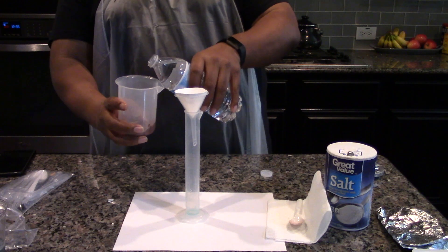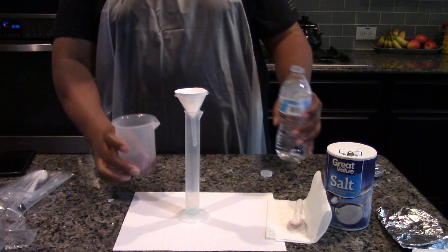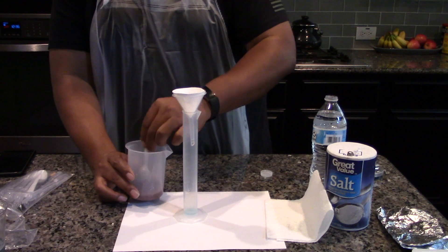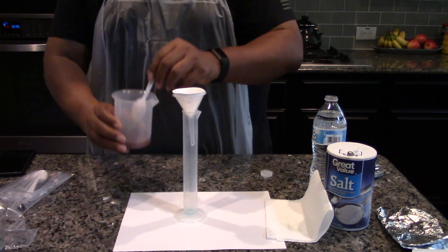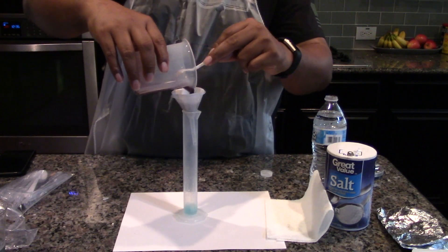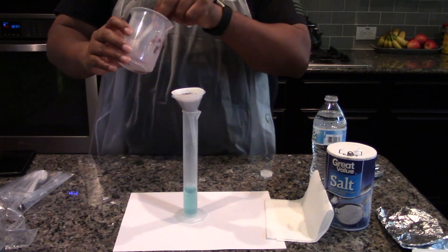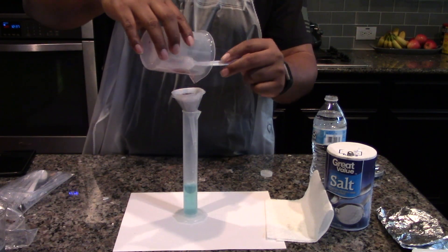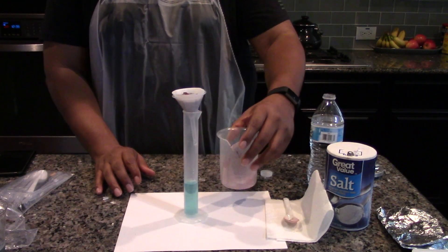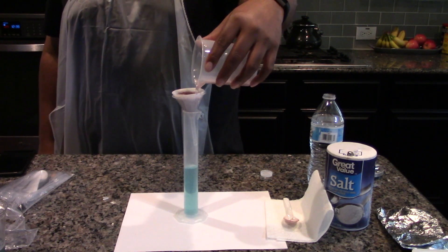Add approximately 20 milliliters of pure water to the beaker containing the copper solids. Stir the copper suspension with the spoon and pour it in the filter funnel. Transfer as much copper into the filter funnel as possible. Add another 10 milliliters of water to the beaker, swirl and pour the rest of the water and copper solids into the filter funnel.